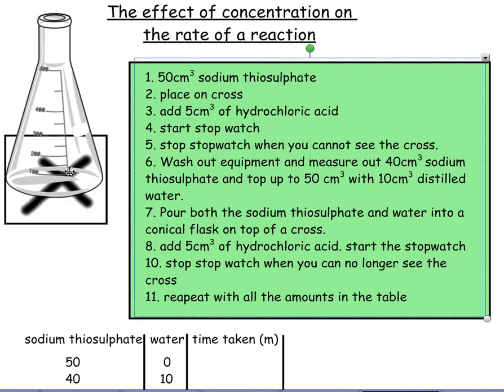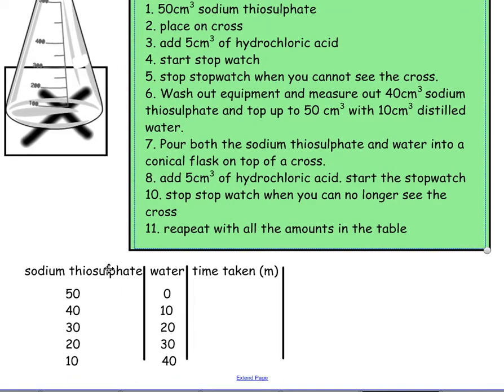So it's an insoluble solid which makes it go cloudy and you can't see the cross anymore. You change the amount or the volume of sodium thiosulfate, and that reduces the concentration of sodium thiosulfate. Really bad table there, no units at all, so that's what not to do because it doesn't tell you anything. 50 what, gallons? I don't know. Anyway, so this one is the most concentrated because it's not diluted by the water at all, and then they get progressively more and more diluted.